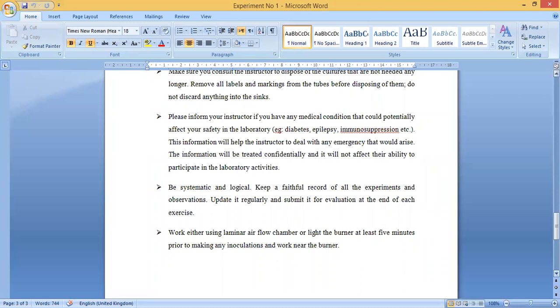Please inform your instructor if you have any medical condition that could potentially affect your safety in the laboratory — for example, if you are a diabetic patient, have epilepsy, or have immunosuppression and need to deal with disease cultures. This information will help the instructor handle any emergency. It will be treated confidentially and will not affect your ability to participate in laboratory activities. The instructor must be vigilant about your health conditions.